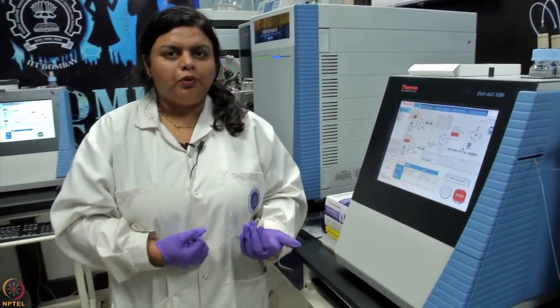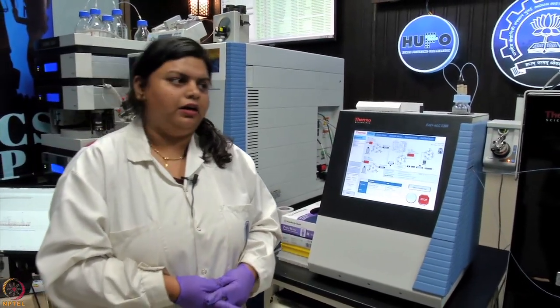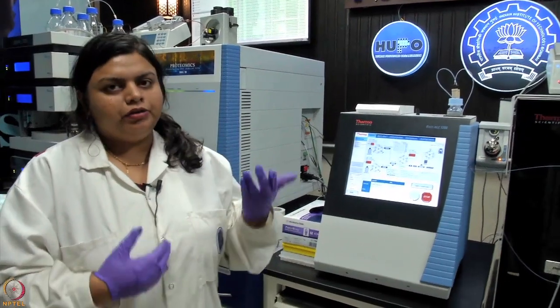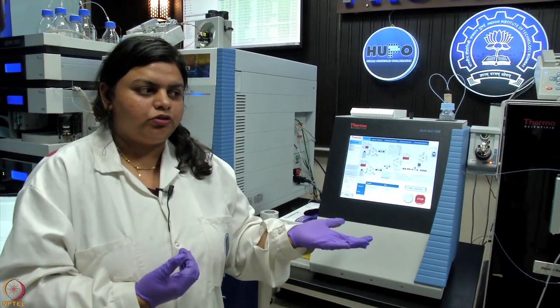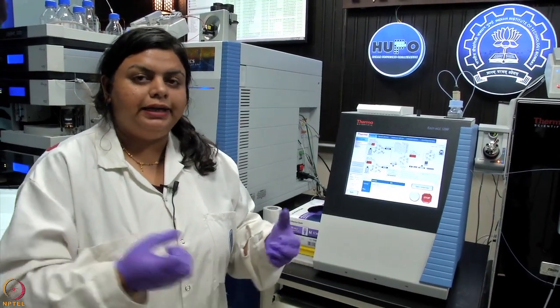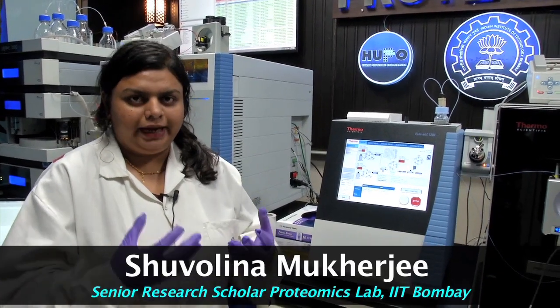Therefore, IPMS gives a very nice approach to identify not only just one protein, but also its interacting partners. And not only that, one of the advantages it has over traditional immunoprecipitation approaches is this: immunoprecipitation mostly is followed by a Western blot, in which another counter antibody is used to see whether the protein of interest is binding to other interacting partners, and there are issues related to antibody specificity and cross-reactivity. In this case, whatever has been pulled down by the antibody and whatever has been bound to the bait, that is the protein of interest, the bait and the prey can be characterized very confidently using mass spectrometry. In the next lecture, you will learn in detail how this approach works. Thank you.